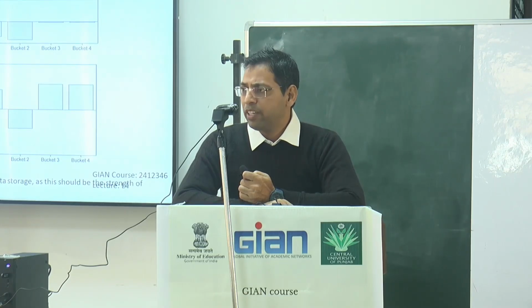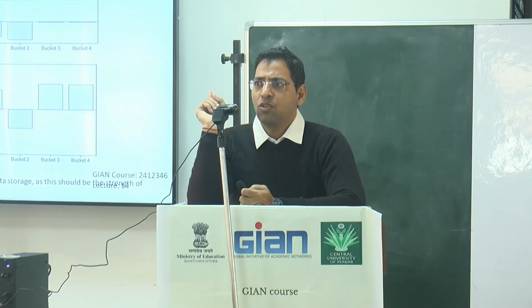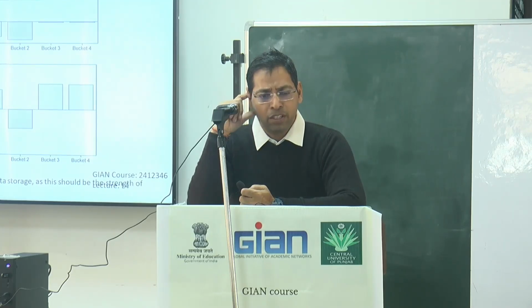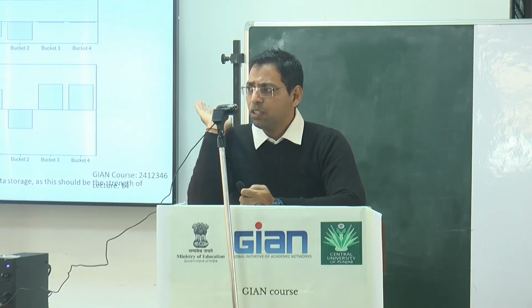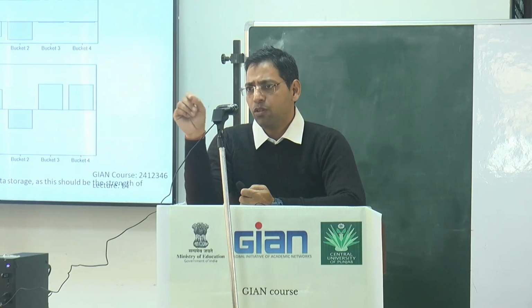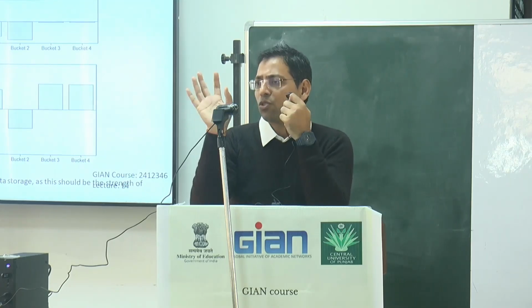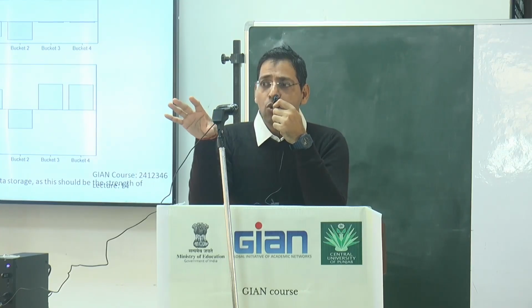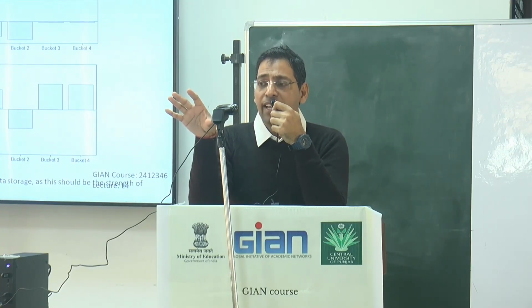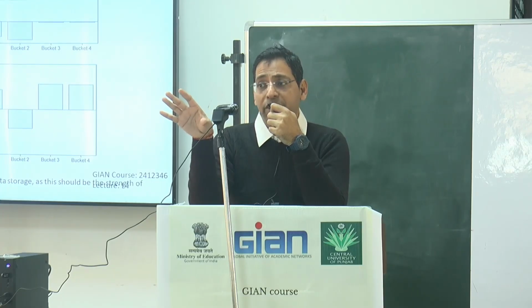So, because we just covered the different parts actually, I will try to give you the screenshot of the paper that was published in Nature Protocols. They use different parameters for the different spectroscopy. They give the fixed values. You use this one, so you will get that type of spectroscopy. If you are using these conditions, you will get a different type of spectroscopy. And solvents, as I know, more than 120 different combinations of solvents are used in good laboratories to get better coverage actually.